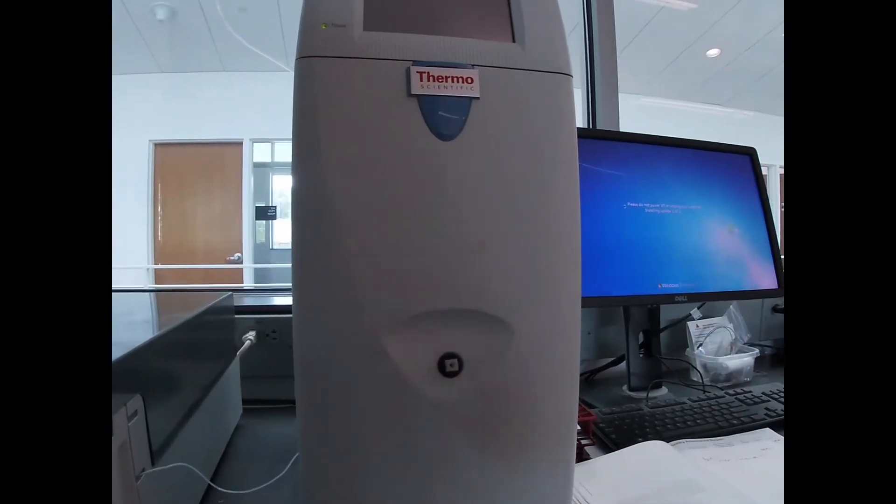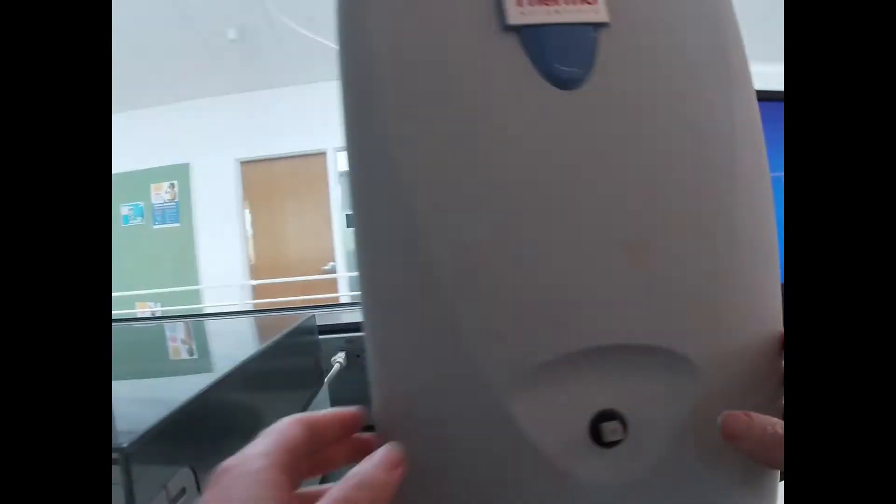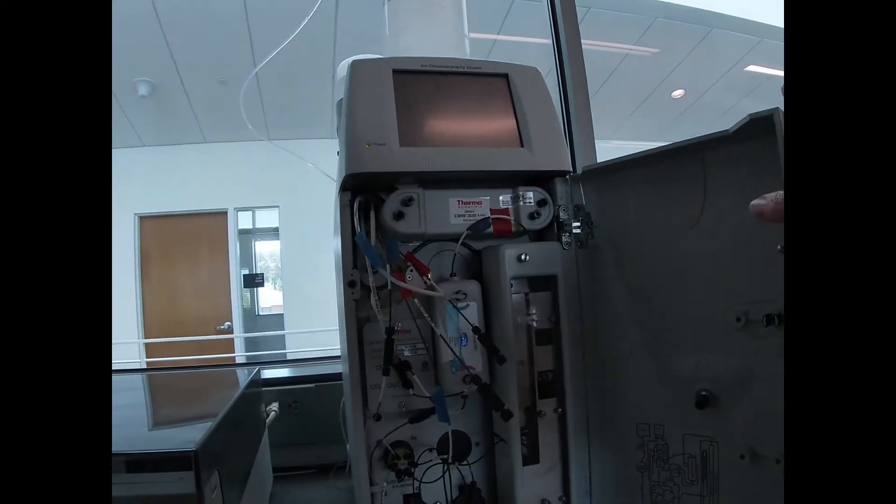This is our Thermo-Dionex ion chromatography system. So let's give you a little tour of what we have going on here.